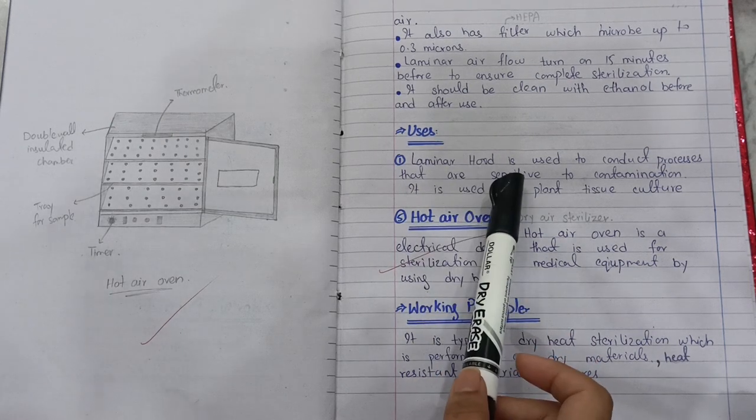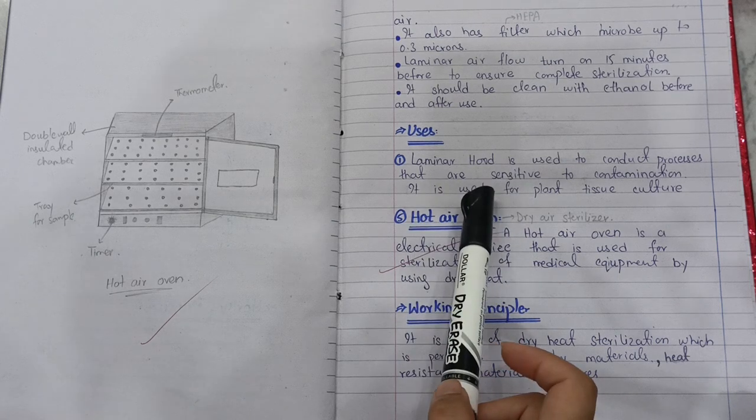Uses: the laminar hood is used to conduct the processes that are sensitive to contamination.